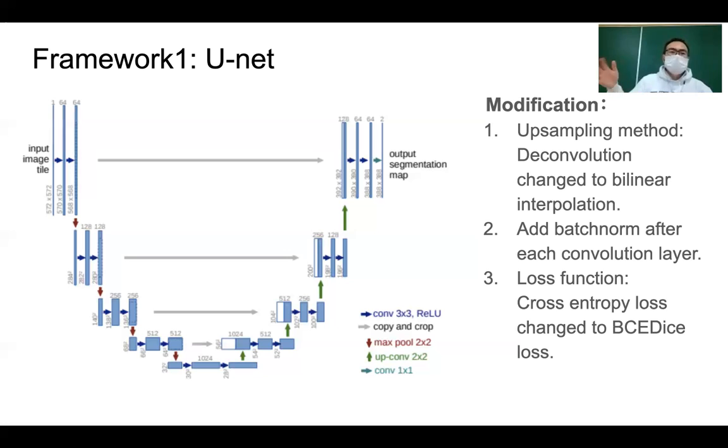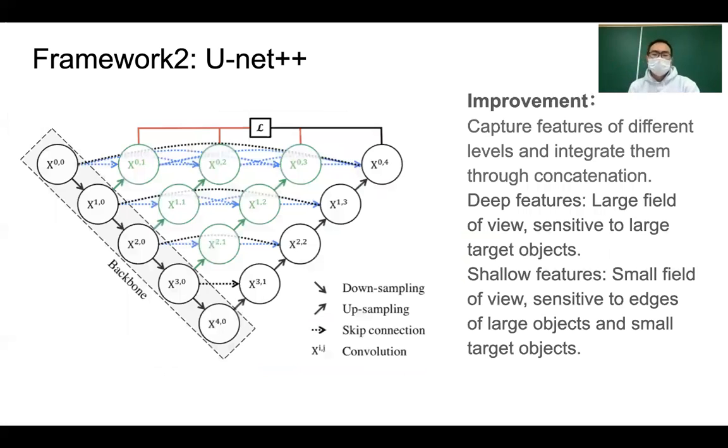We do a binary classification for every pixel, whether it belongs to the background or to the ROI within the circle. We will also implement UNet++, which is a fancier version of the UNet, where we have a bridge of convolutions between the down-sampling and up-sampling parts to allow further communication between these two. It contains more parameters and is slower to train, but it may produce a better result.